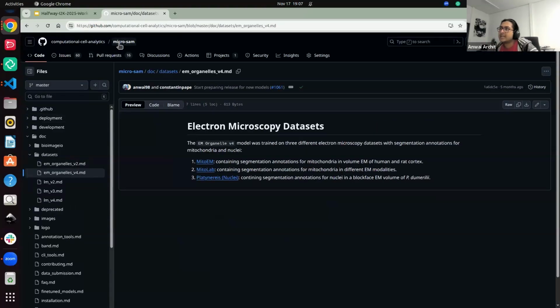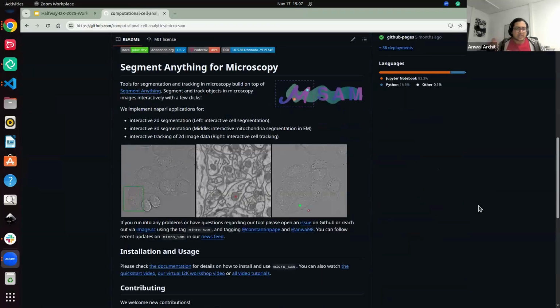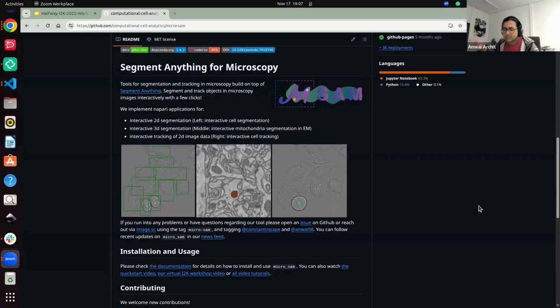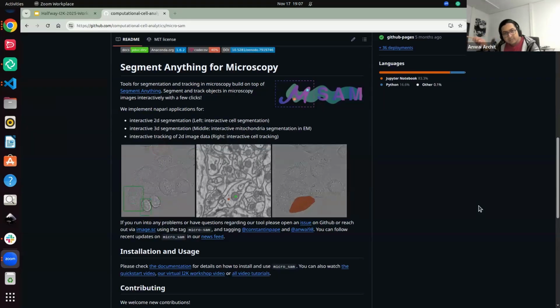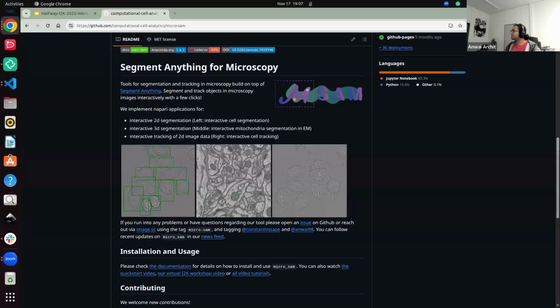So this is the current release, wherein we found a tiny bug in one of the modeling strategies and convolutions. I won't dive into the details, but the idea was simply there were some artifacts being picked up. We had a follow-up paper, we identified the problem, and fixed it in Microsam. I can send you the paper as well. Wow, a lot of promotion for me.